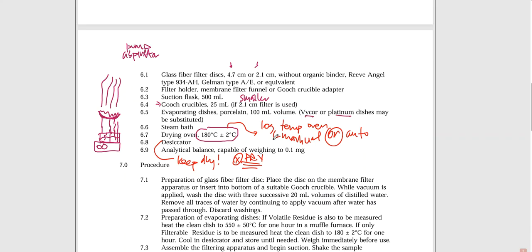So in other words, you can't just put a glass of water into a desiccator and think that that desiccator is going to be able to fully dry out all of that water and capture all of that water. That is not how desiccators work, nor is that their purpose.